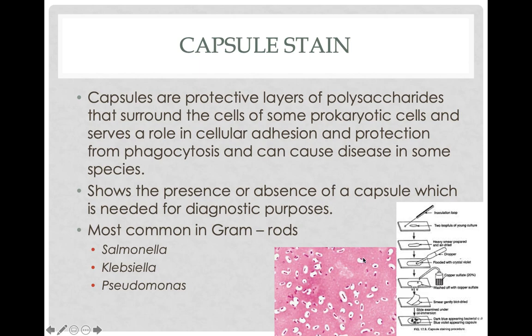So what a capsule is, it's kind of a little protective coating that bacteria can produce for themselves. You can see here, this is the bacteria itself, the little tic-tac in the middle. And this capsule is essentially just a little blow-up balloon, a little zorb if you like, of sugars and proteins and junk that the bacteria has produced that grows all around it.